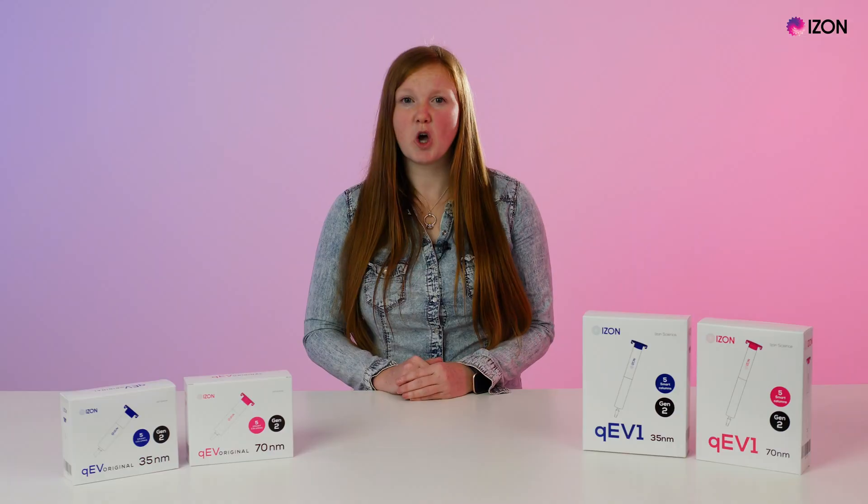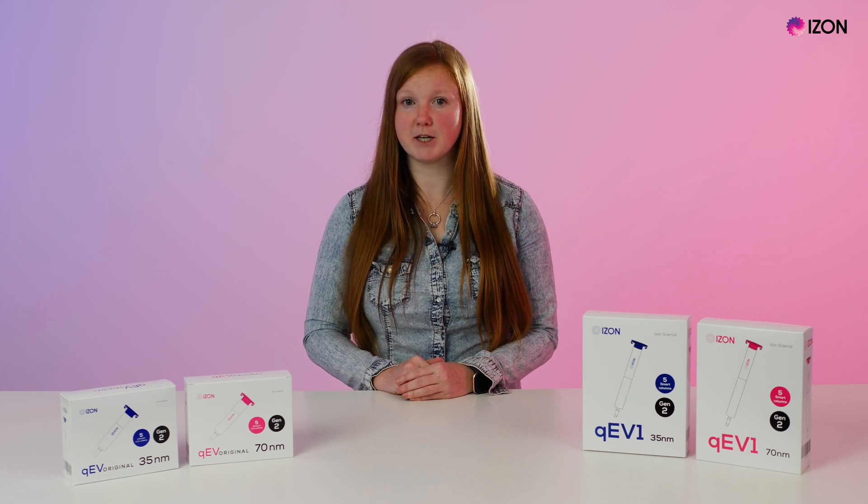When it comes to EV isolation, maximising sample purity is critical to enabling reproducible measurements downstream. Better purity leads to deeper insights and ultimately creates greater opportunities for the EV field. Over the years, our efficient and scalable EV separation platform has become the method of choice for many in EV research, diagnostics and therapeutics.